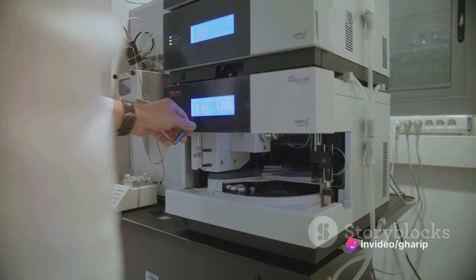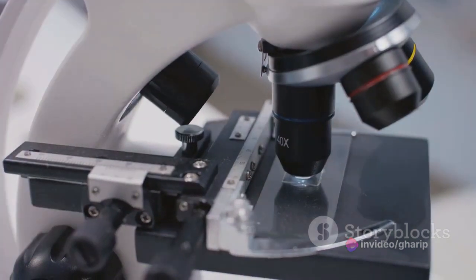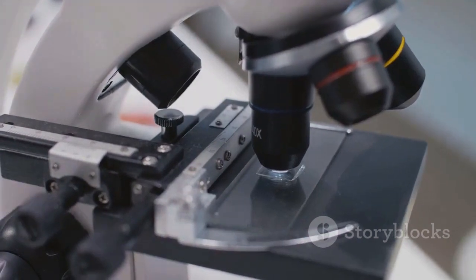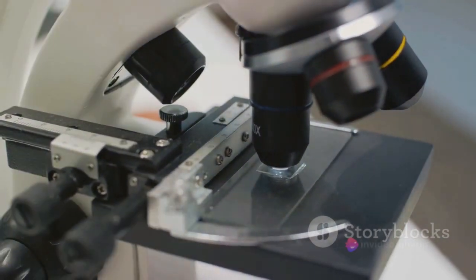This powerful technique not only amplifies targeted DNA molecules, but also allows us to monitor the amplification during the process, making it a tool of choice in various fields such as medical diagnostics, genetic research, and forensic science.